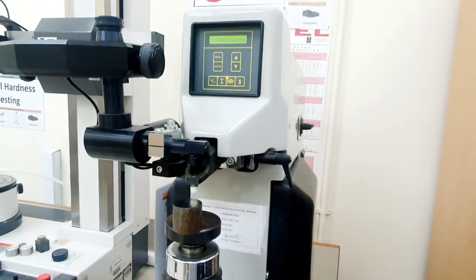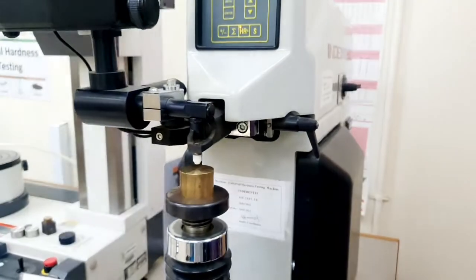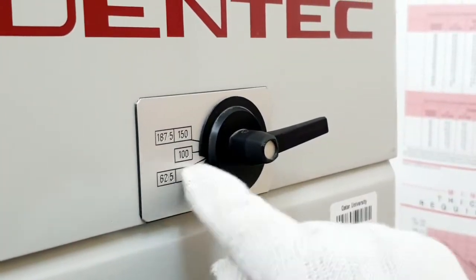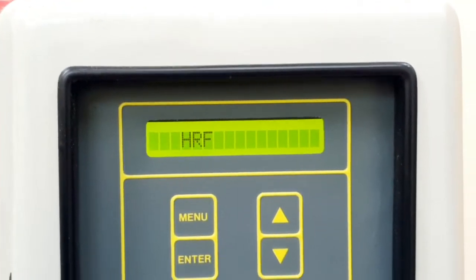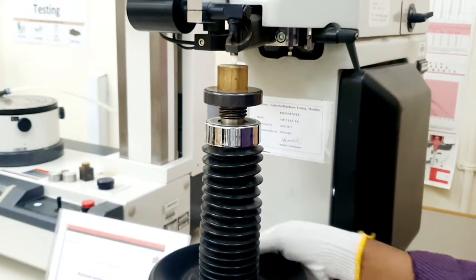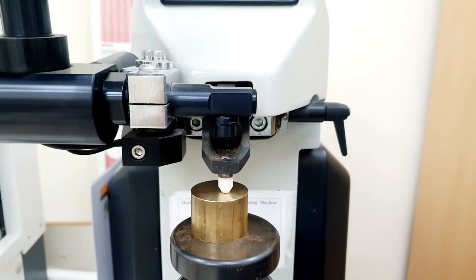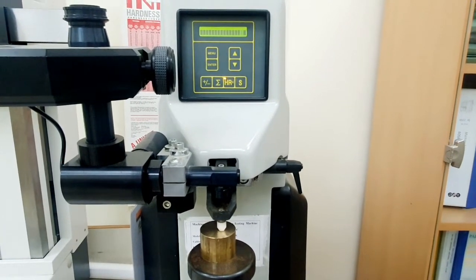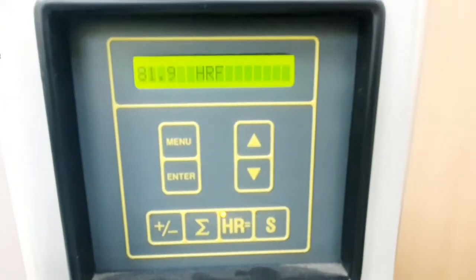Let's move to the Rockwell hardness measurement for the aluminum and brass samples. We place the brass sample in the machine — it is a non-ferrous material and the indenter type is the same. We set the load to 60 kilograms because we need a lower load for non-ferrous material. Once we do this, the scale automatically changes to HRF. We adjust the table until the sample just touches the indenter and hear the beep sound. The test starts automatically — the machine applies a load of 60 kilograms for 15 seconds and gives the hardness value. The result is 81.9 HRF for the brass sample.